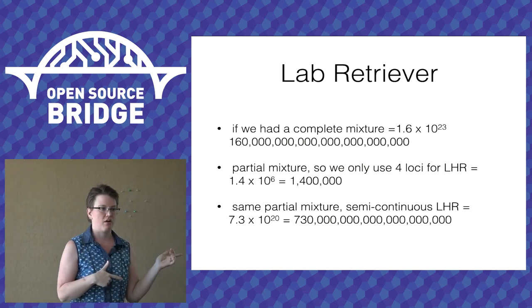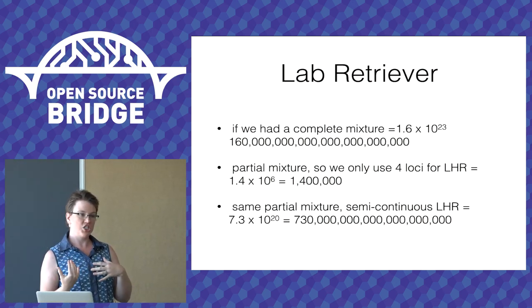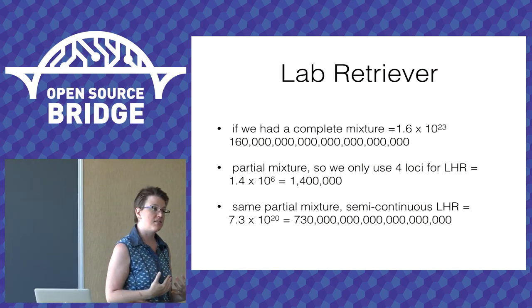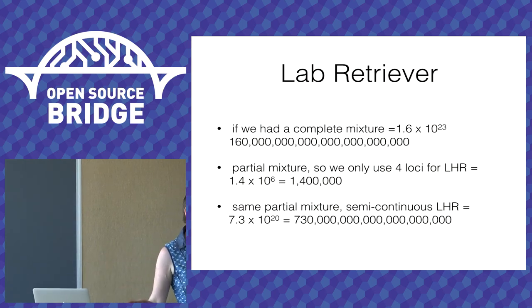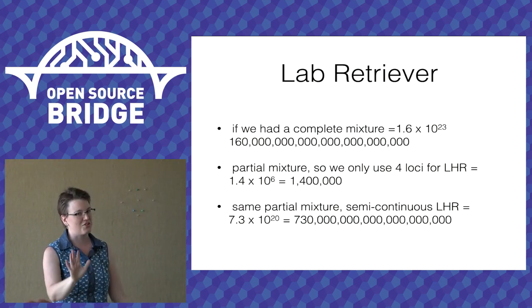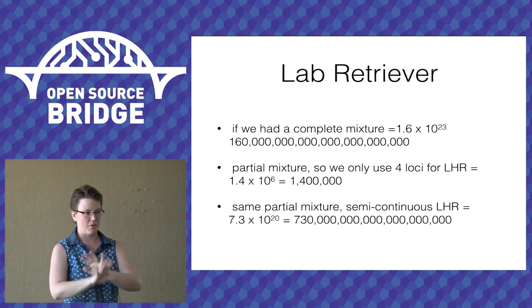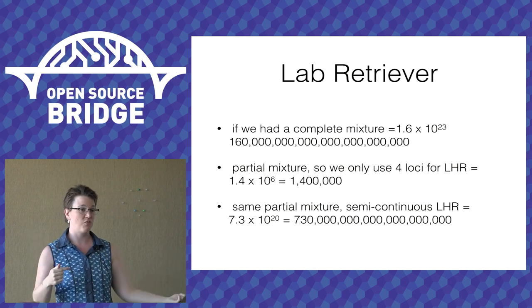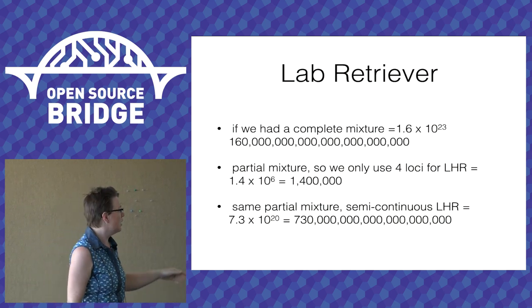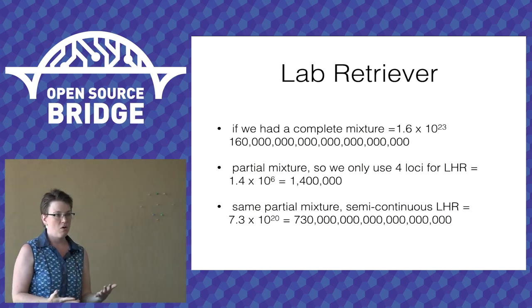This is so much better, so much better. I have not unconsciously or consciously applied any bias to using bits and pieces of the mixture. I just threw the whole mixture in there and said, hey, software program. No, you have to trust your software program. I have to validate this program upside down and sideways and everything so I can go into court and say, software is doing what I think it's doing. But I'm not putting my spin on the mixture.